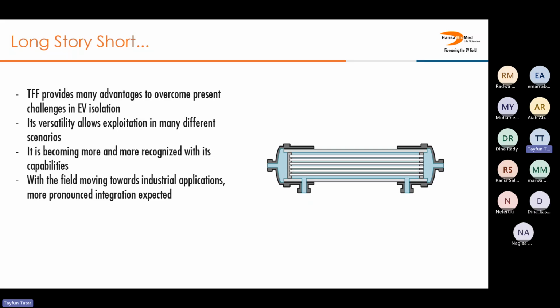So in order to summarize what I presented to you, first of all, TFF provides many different advantages to overcome the present challenges in EV isolation. Of course, it is not enough to say that this is the ideal method because we all know that there is no ideal method for all the possible scenarios in EV related workflows, but it overcomes many challenges in the field, and its versatility allows that it can be utilized in many different scenarios.